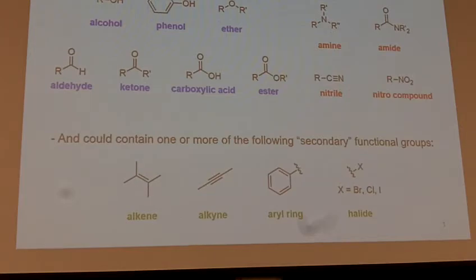Potassium permanganate test, and what other test? And the bromine test. So you needed both of those tests to be positive, and then that would represent most likely you had an alkene or alkyne. Same thing goes this time around, okay?